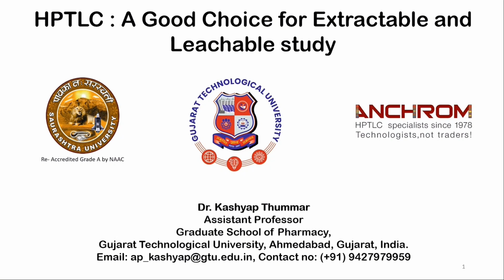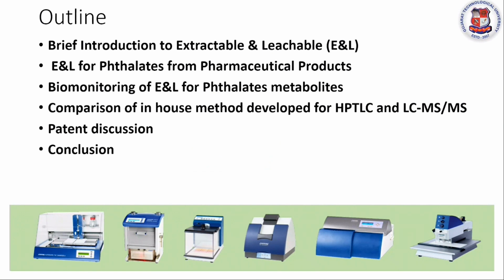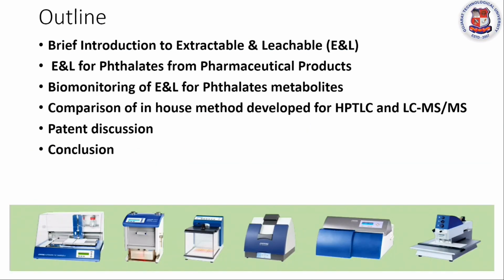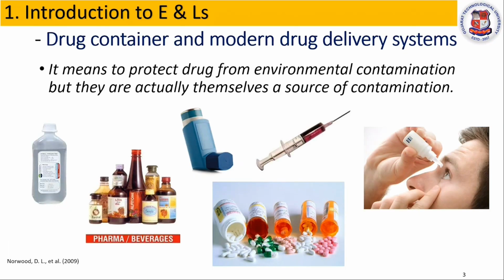Today I'm going to present my research on HPTLC, a good choice for extractable and leachable study. So this is a brief outline of my presentation. It is divided into three parts. First part is extractable and leachable study for phthalates for pharmaceutical product. Second part is biomonitoring of these leachables' metabolites, and third one is a comparison of in-house method developed for HPTLC and LCMS. So let's start with the first part.